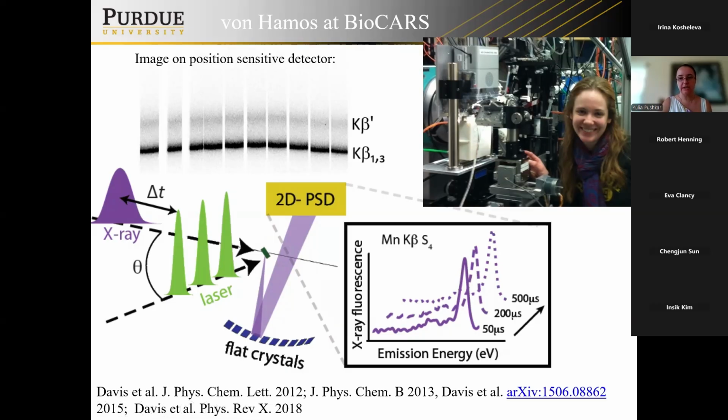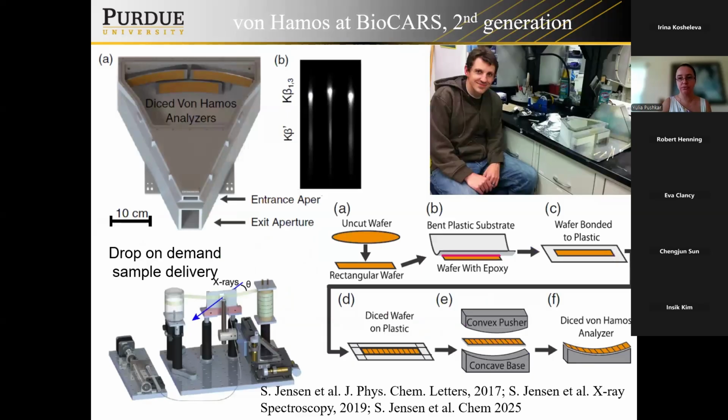And we did some studies with this spectrometer, but then there was a push to improve it, to make it even tighter in terms of better background rejection and a bigger solid angle to catch as much fluorescence as we can. And this came to these boxes. This box is a 0.5 meter von Hamos, so it's getting a bit bigger. But that's as big as it gets. It's half a meter in one dimension. And now we have several boxes for several very interesting biological lines. I'll show you a table, and there is a procedure.